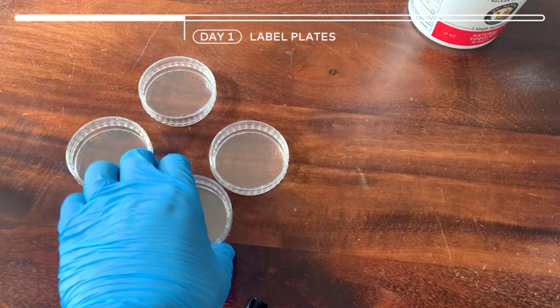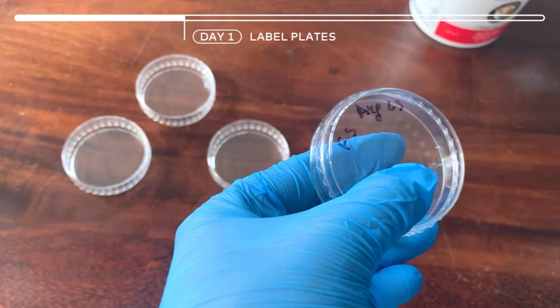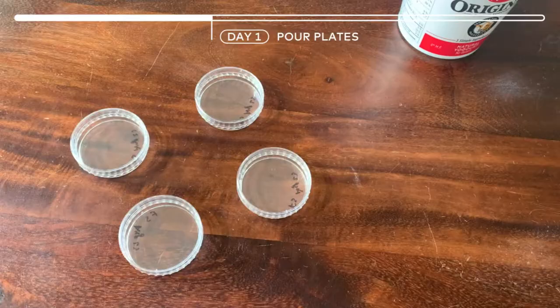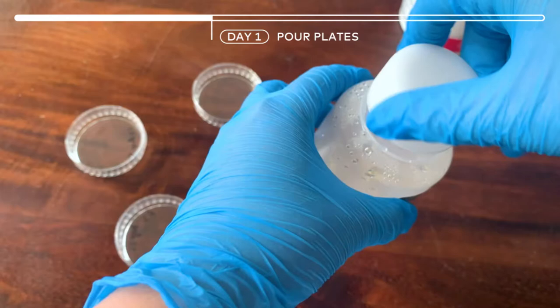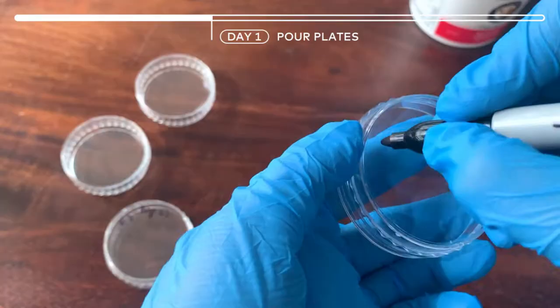You can label your dishes in different ways. Right now for us, we can just put our initials and perhaps the date, and we're adding that on the bottom. Once you have well mixed your antibiotics, you shouldn't see anything except clear liquid. Now we're going to pour our agar into the petri dishes.